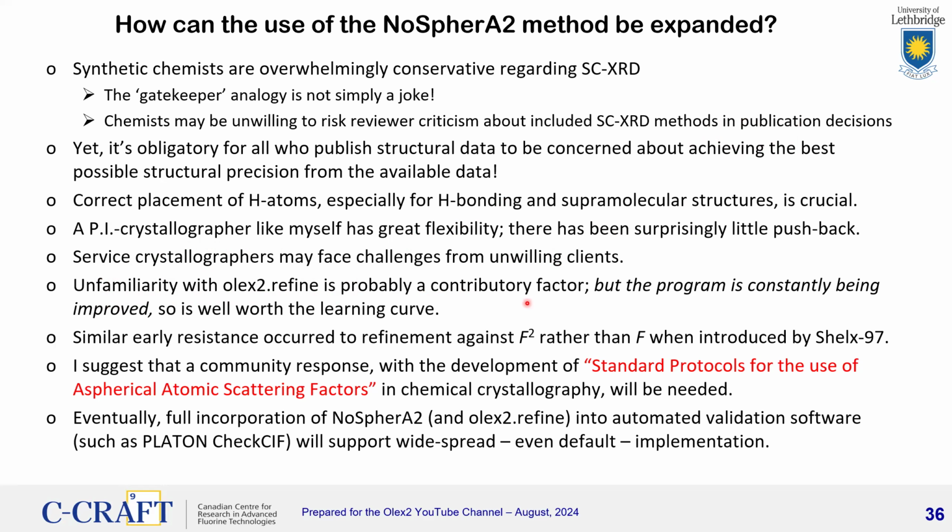But we found that the software is well worth the learning curve because it is a modern piece of software that is undergoing constant improvement. So new features are coming out, and so there's a bright future for this method that parallels that of NoSpherA2.